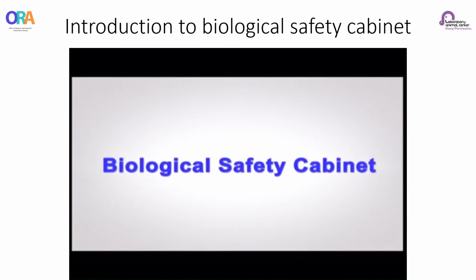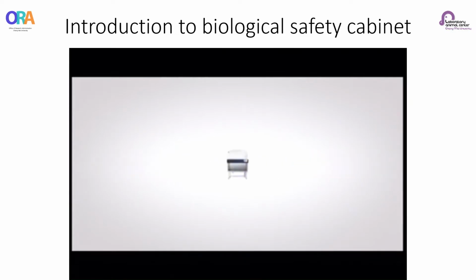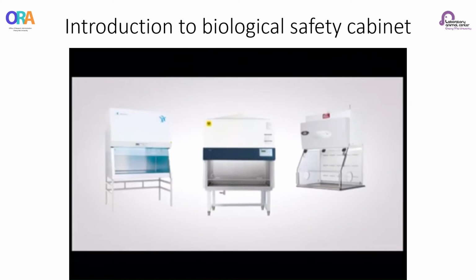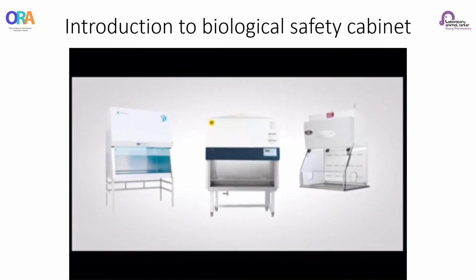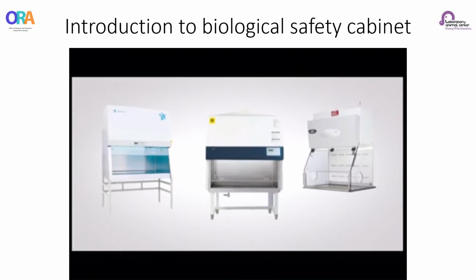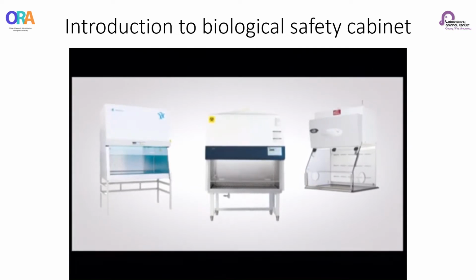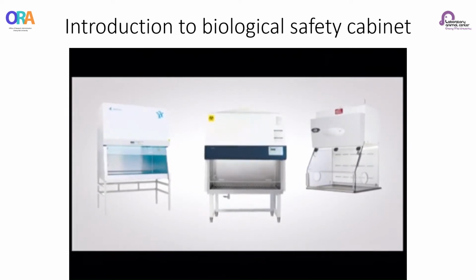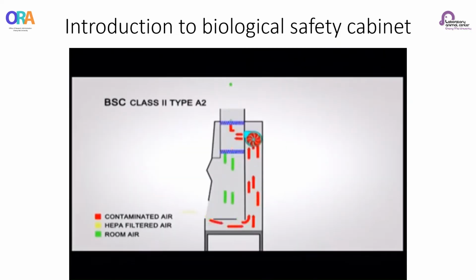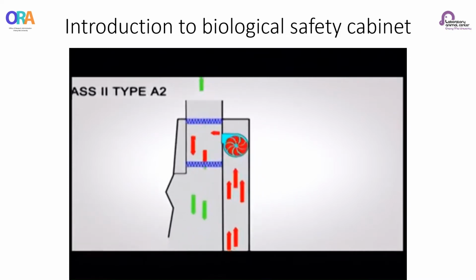Biological Safety Cabinet, or BSC. The Biological Safety Cabinet, or BSC, is a vented enclosure that is used in laboratories to minimize the exposure of laboratory personnel to aerosols or droplets while they are working with infectious agents and toxins, IAT, or biological select agents and toxins, BSAT. It is important to certify cabinets annually.